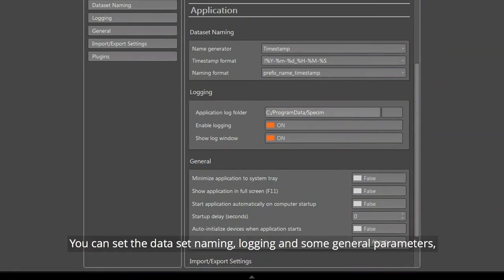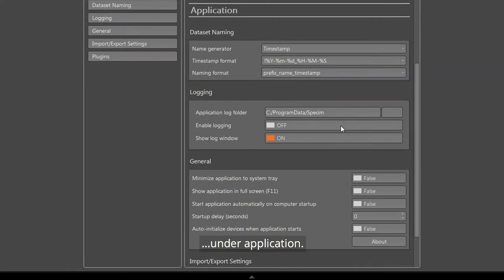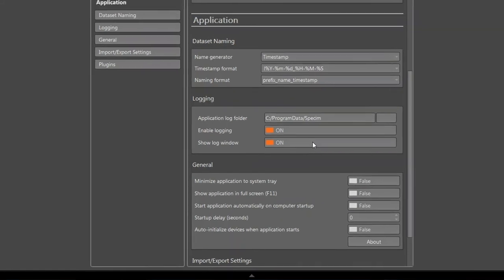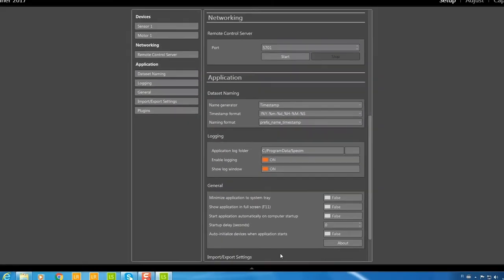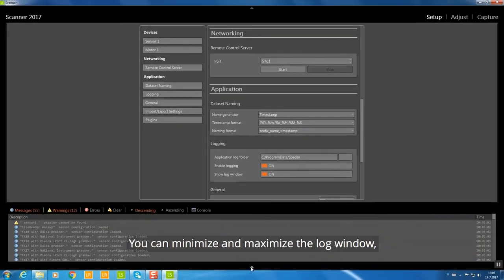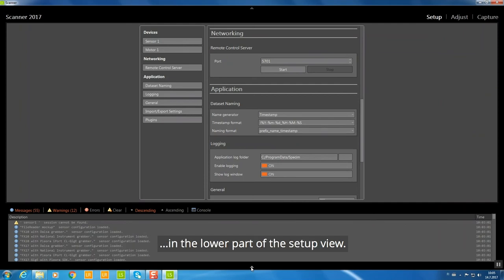You can set the dataset naming, logging, and general parameters under Application. You can minimize and maximize the log window in the lower part of the Setup view.